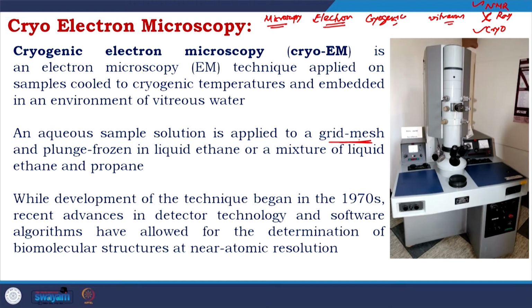While development of the technique began in the 1970s, recent advances in detector technology and software algorithms have allowed for the determination of biomolecular structures at near atomic resolution.